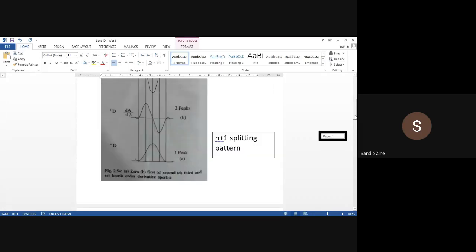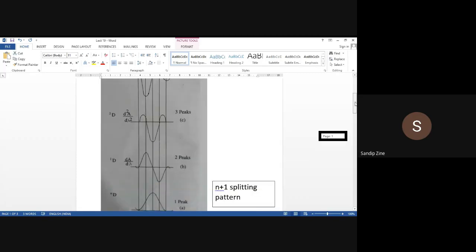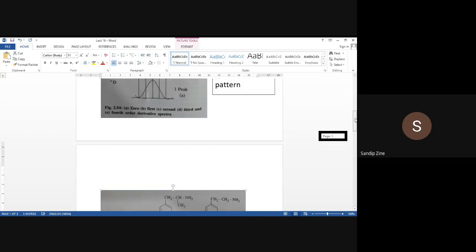This is one of the major applications of derivative spectroscopy in pharmaceutical analysis. This difference is made use of in the identification of individual compounds. In this way we can use derivative spectroscopy in our day-to-day analysis to identify or to control background impurity. This is a major application of derivatized spectra.